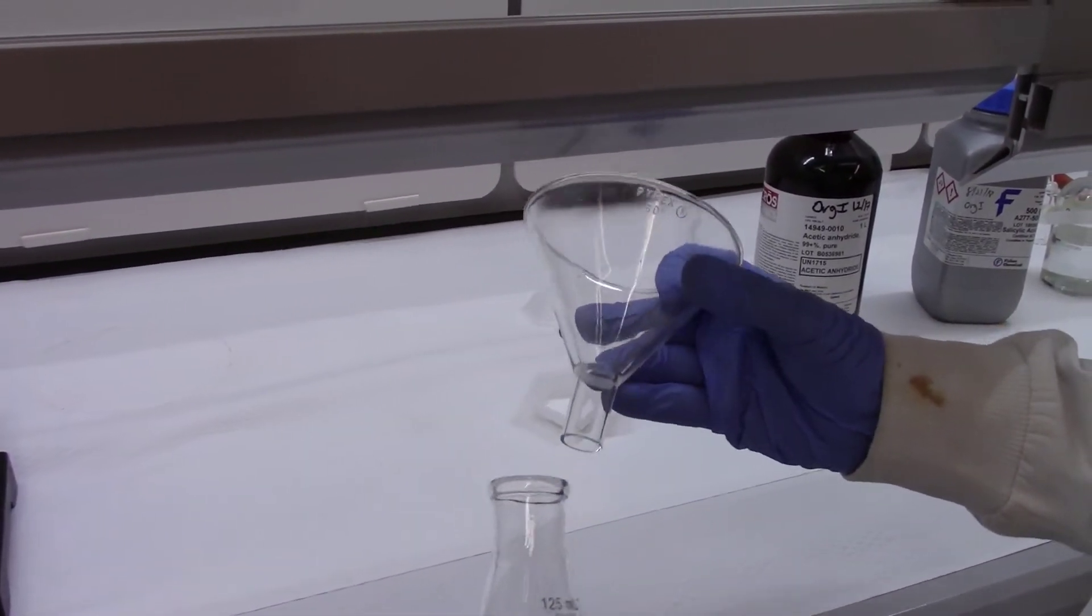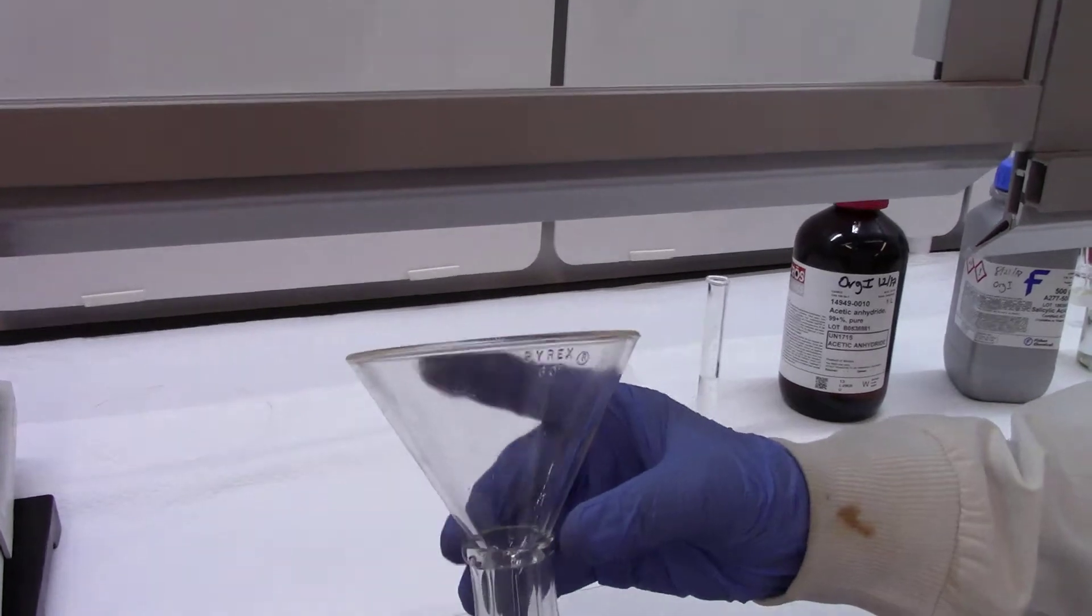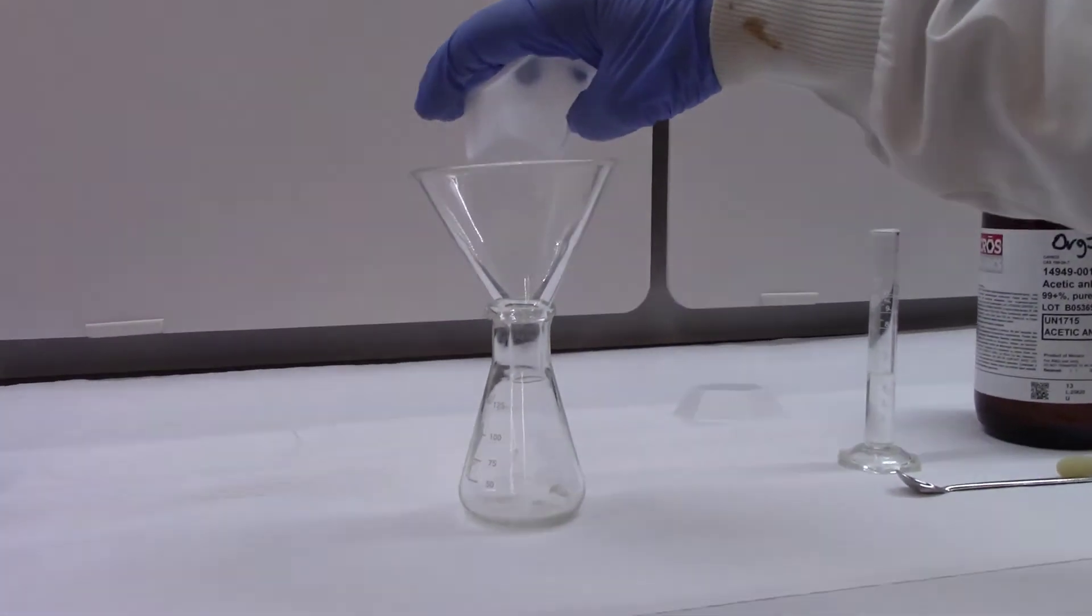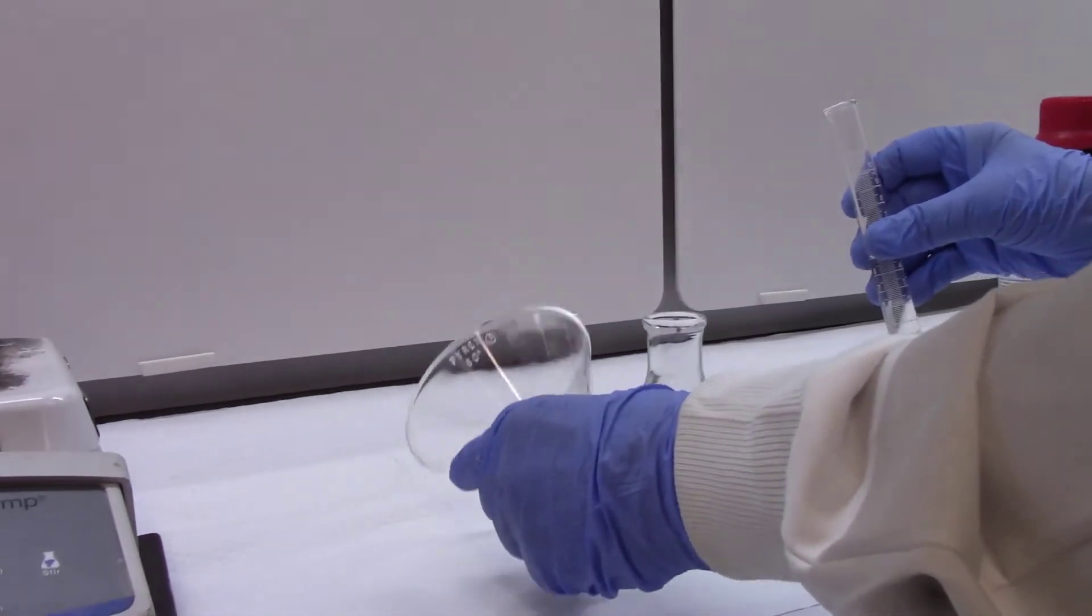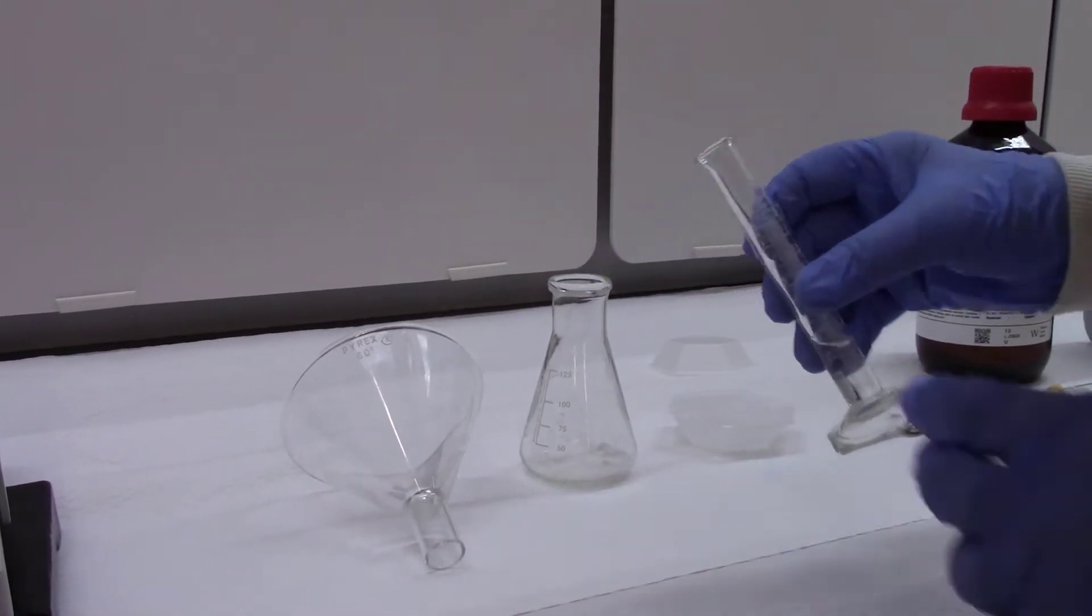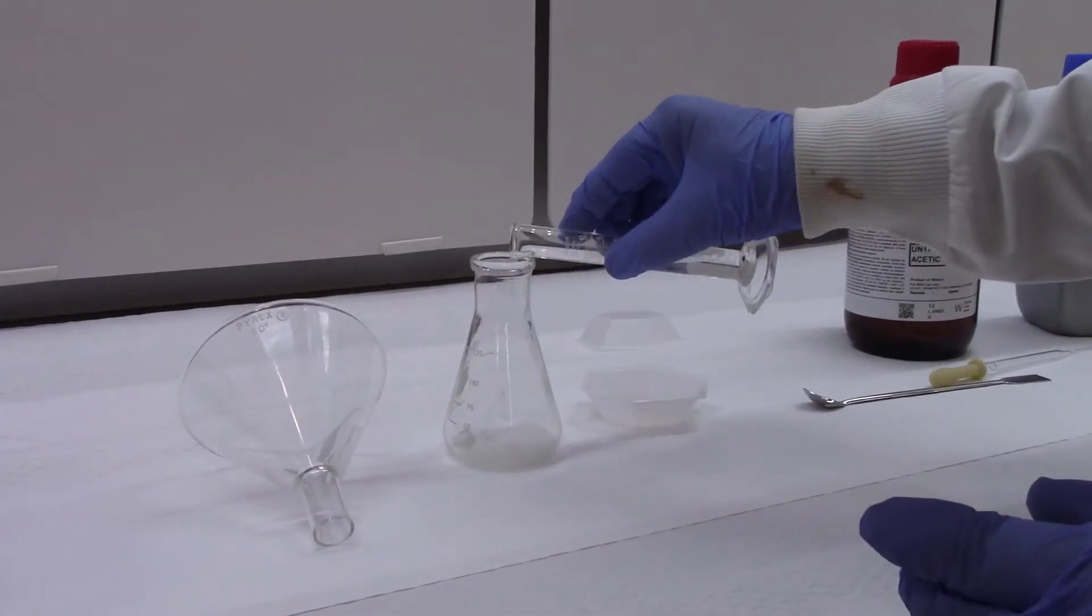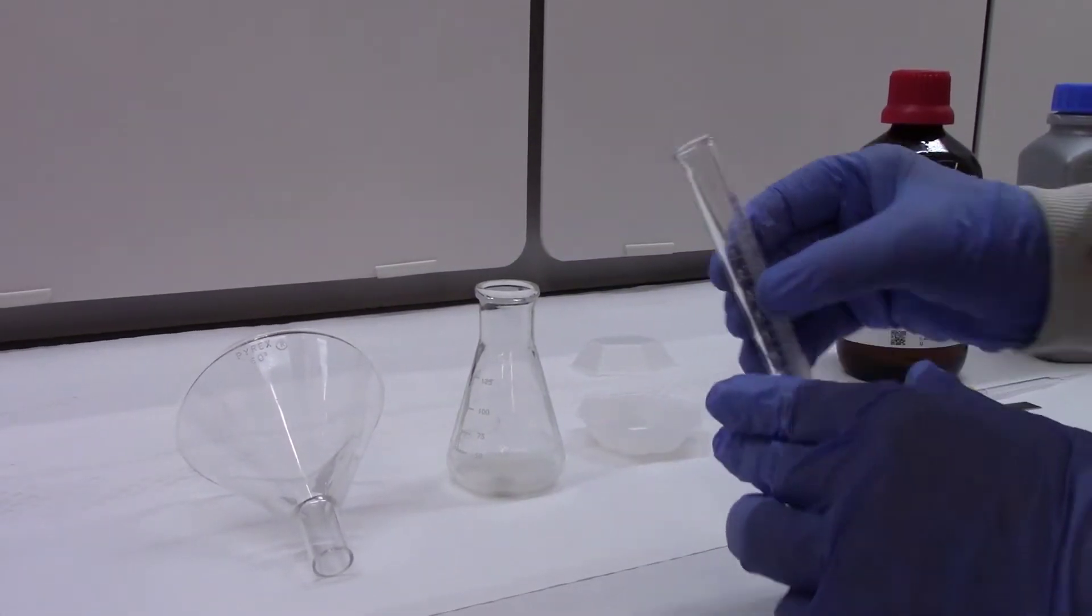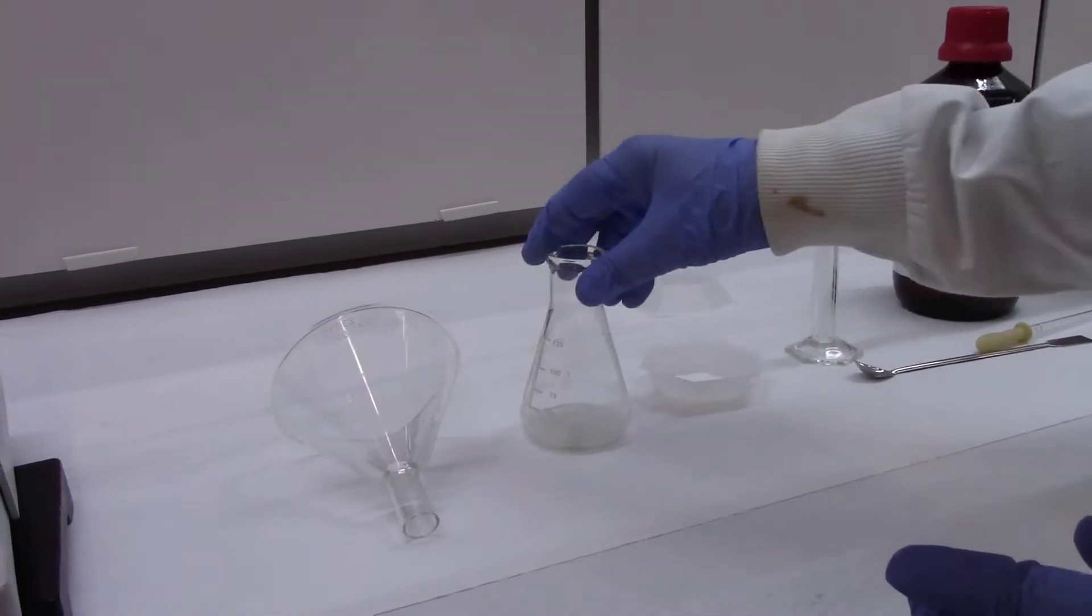This is an Erlenmeyer flask with a stir bar, and this is a wide mouth funnel used for adding powders. I'm adding two grams of salicylic acid in the Erlenmeyer flask. Then I'm going to add portion-wise acetic anhydride. It doesn't have to be very slow. You have to swirl it, add small portions of it, swirl the flask. Swirling is circular motion, it's not shaking.